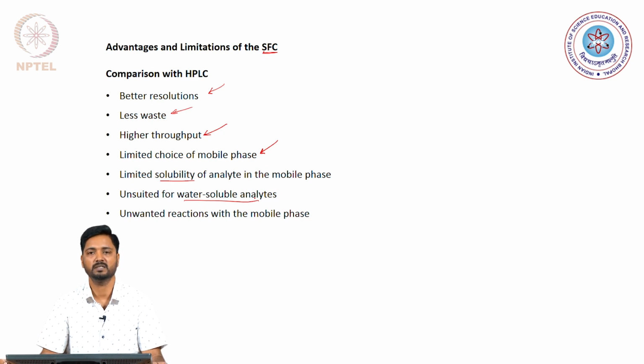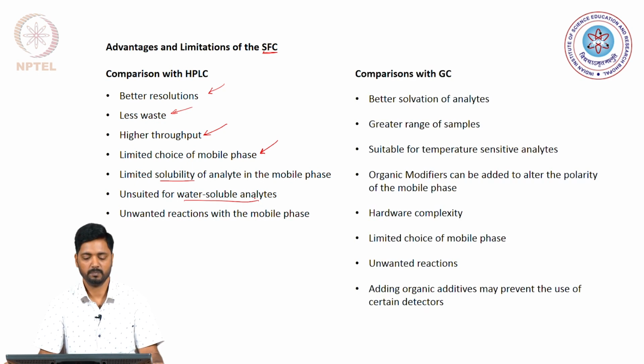It can result in the formation of carbamates, and that of course is an undesirable side reaction that needs to be avoided.